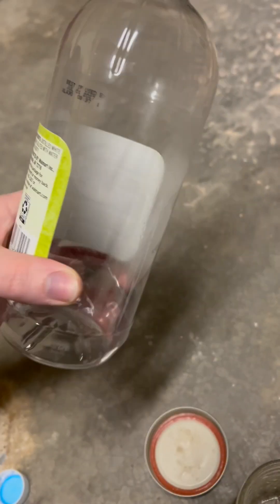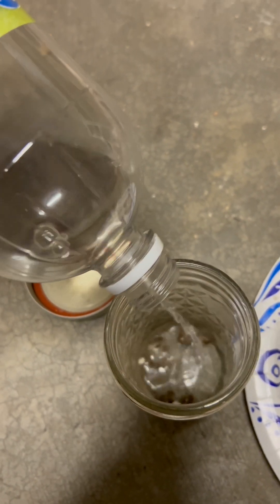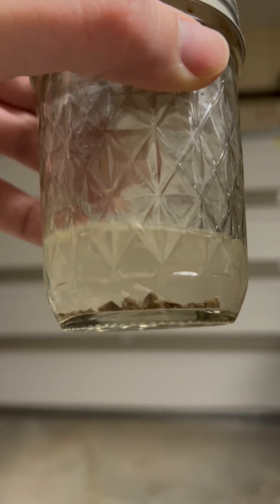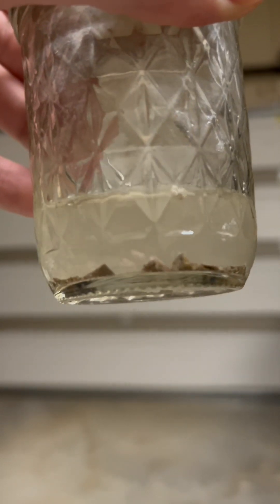Then we dissolve the limestone with the vinegar. See it bubbling and starting to dissolve.